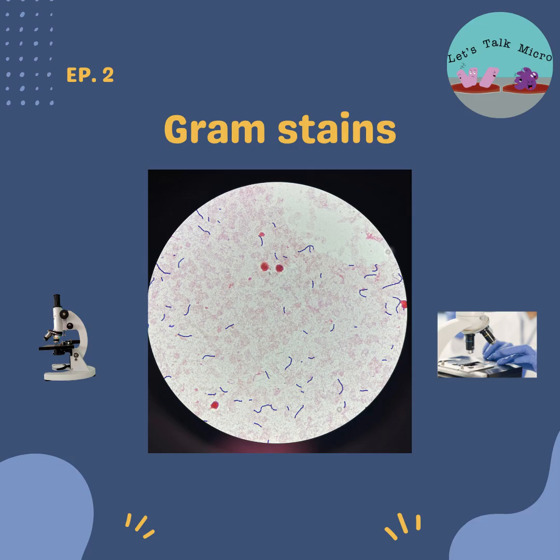So sometimes with decolorizing, you can either do it the way they teach you. Sometimes you just grab the slide, tilt it, and start adding a few drops until you see the purple wash away. Sometimes I find what works better for me is, my slide is flat, I just add the decolorizer, let it sit for 3 to 5 seconds, and then wash it with water. Once you've done this, you add your safranin in, leave that for 30 seconds to 1 minute, and then rinse it with water again.